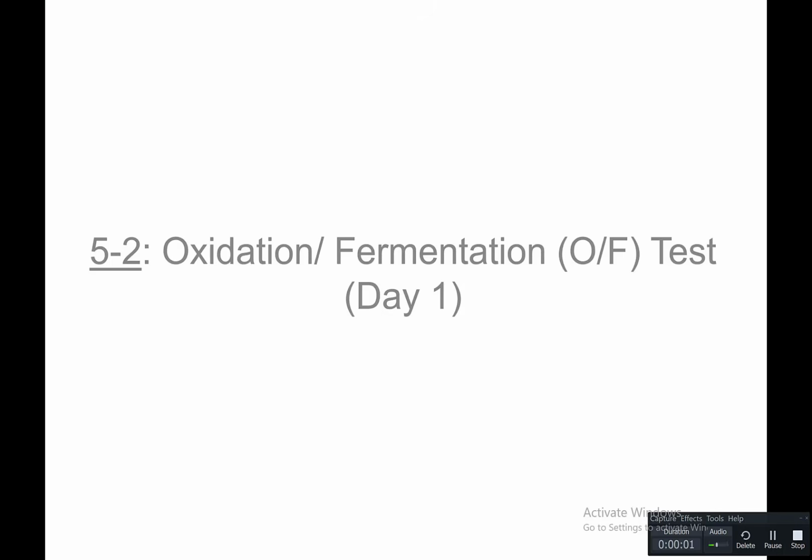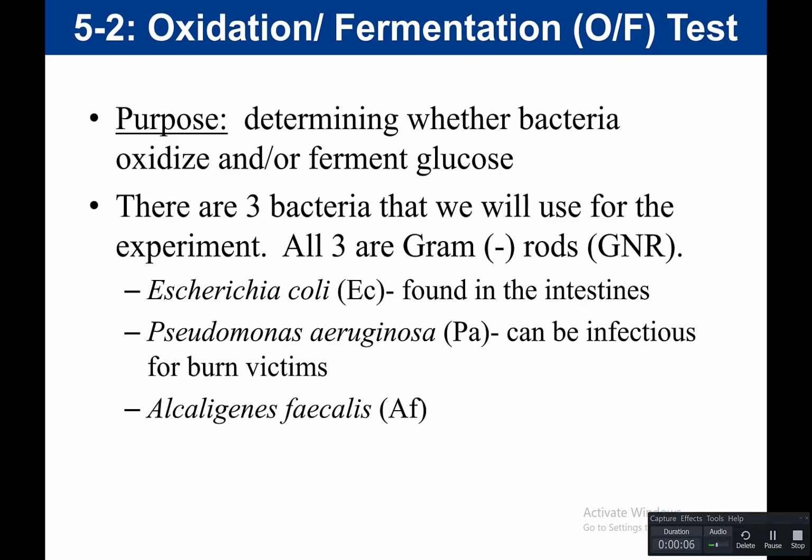So now we're going to move on to our oxidation fermentation, or OF, test. So for this test, you want to know the purpose. And the purpose of this test is to determine whether bacteria can oxidize and/or ferment glucose. So not only are we looking at do they metabolize glucose, but do they do it in the presence of oxygen, which is oxidize, or do they do it in the absence of oxygen, which would be our fermentation?